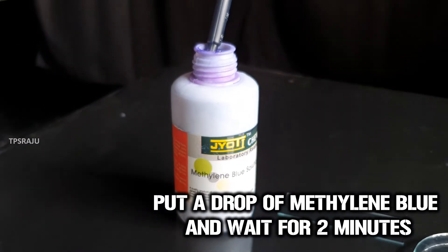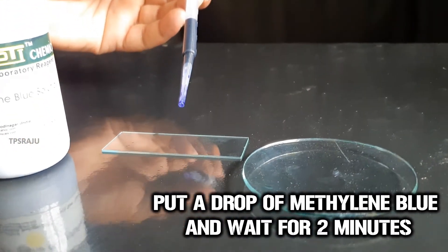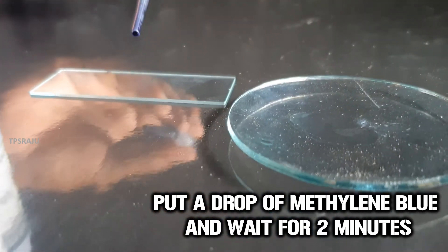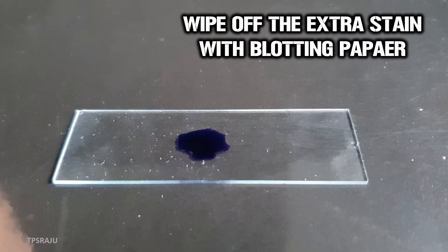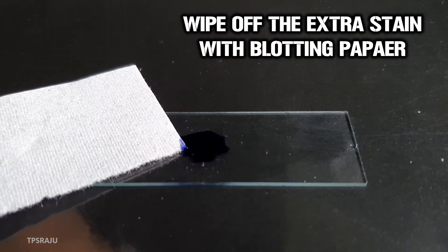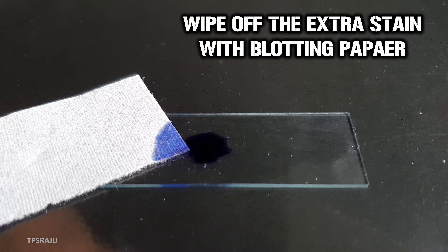Then, put a drop of methylene blue and wait for 2 minutes. Carefully remove the extra stain by using blotting paper.